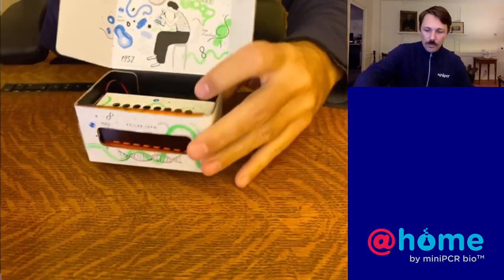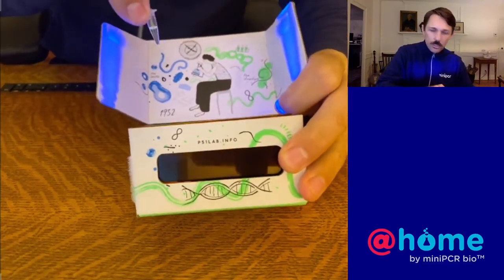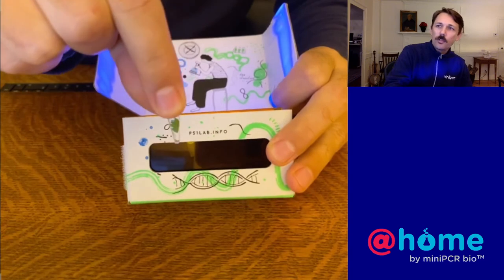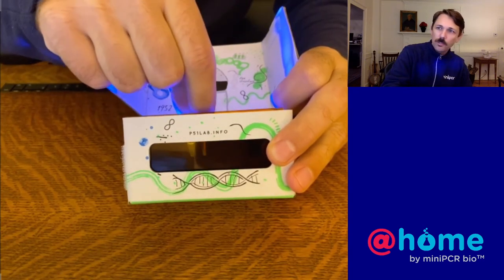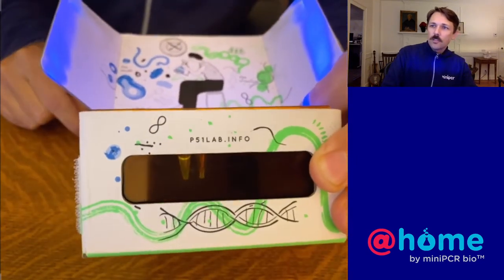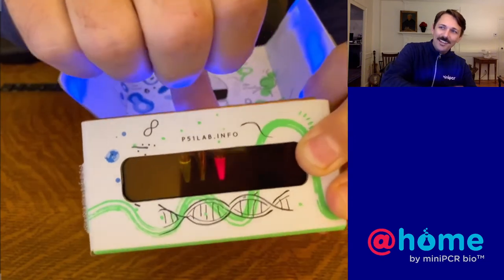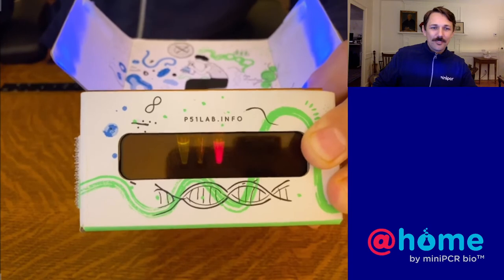So in my P51, I'm going to put a negative control. This is just some plain acetone that I've prepared in advance. I then have a tube where I put a little bit of cilantro leaf in there so that we can see what happens when a whole leaf is put in. Now, as you can see, not much. And so then I'm going to put in my chlorophyll. Look at that. Look at how brightly red that fluoresces. That's just fun to look at.